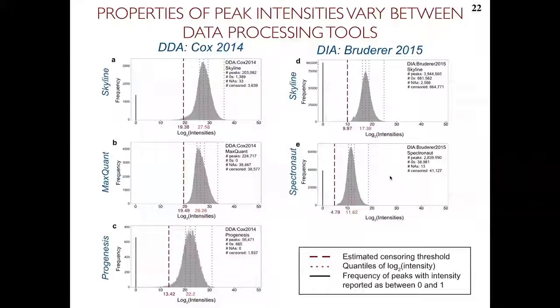So we try to essentially not interpret this literally, but try to understand what the intention behind these values is. And so what we decided is to say, okay, when peaks have low values, we essentially don't trust them. Call them NA, 0, small values, no matter what, we will not trust these values. And by low values, essentially, we came up with this vertical threshold, and it's completely empirical. So the way we decided, so those histograms in many data sets we looked at, they're roughly symmetrical, more or less. So what we did was we took the median, we look at the 97th quantile to the right, calculate the distance from the median, got the same distance to the left of the median, and this is our threshold.